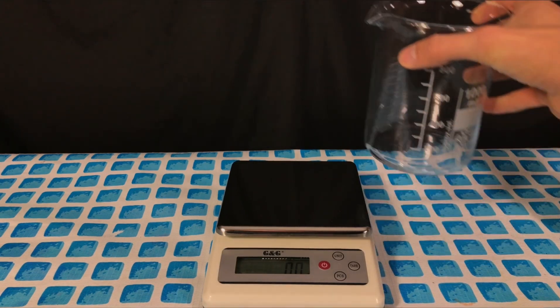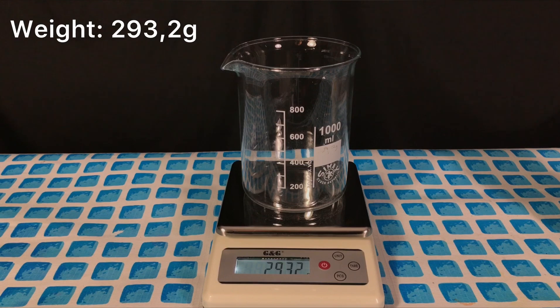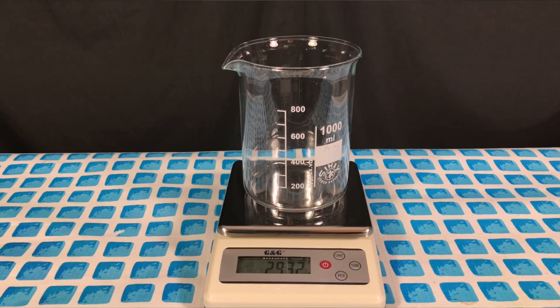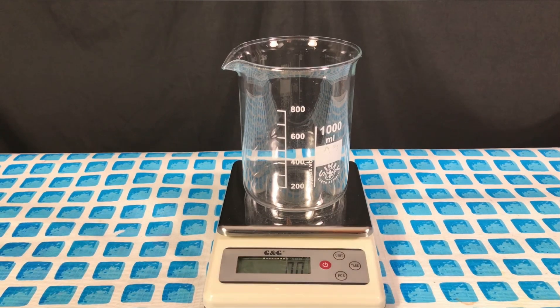We then start off by weighing an empty beaker. This way determining the yield later on will be easier. The scale was set to zero. 84 grams of sodium bicarbonate were then weighed out.